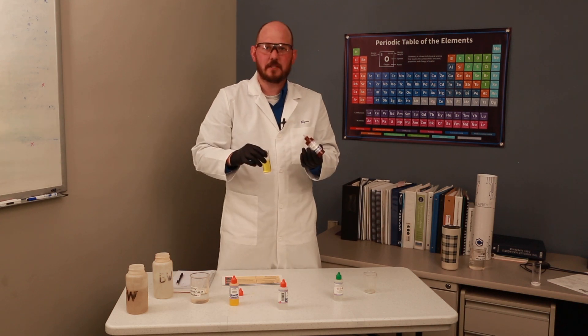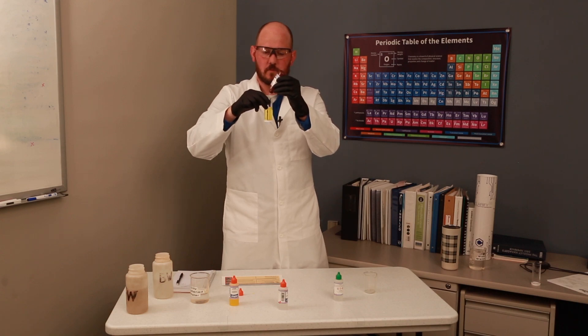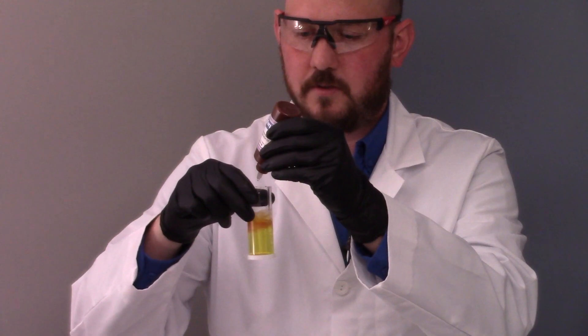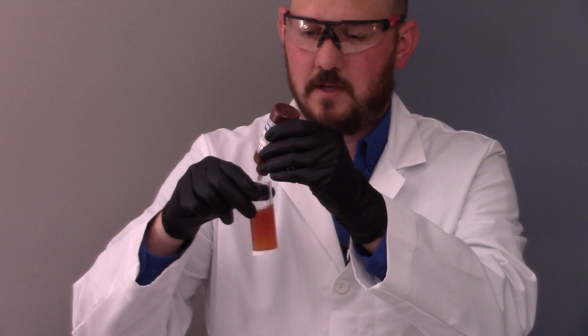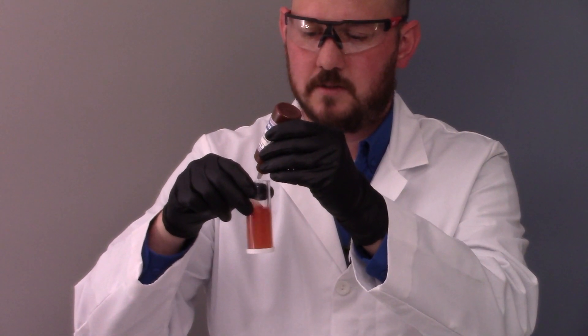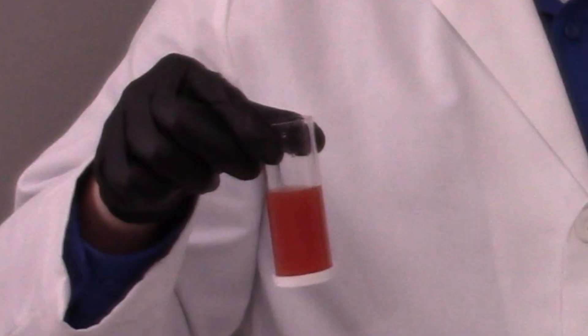Counting drops again, same as last time, just with that added step for the acid. Seven drops total. We're back to that murky brownish red.